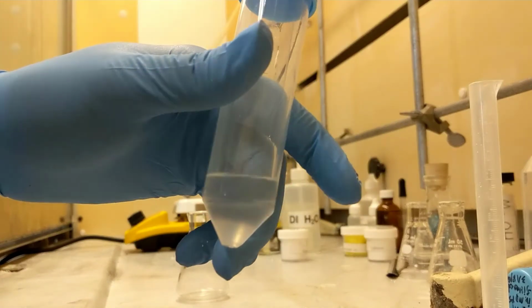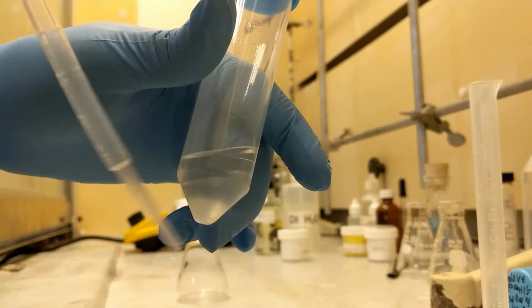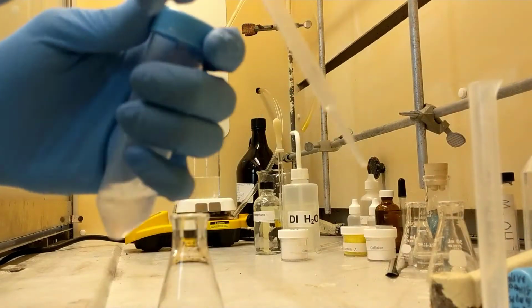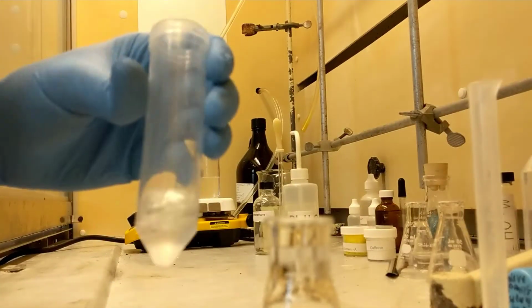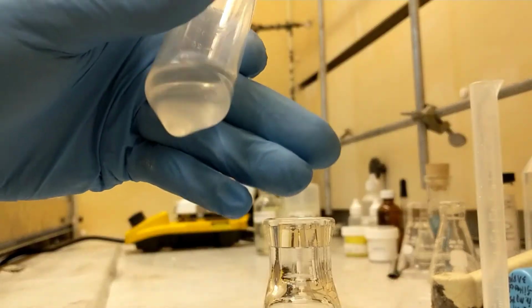So what I'm going to do is pull the methylene chloride off the bottom layer, put it into this flask. I'm just going to do that now. So to do this, let's see if I can get a good shot of it.